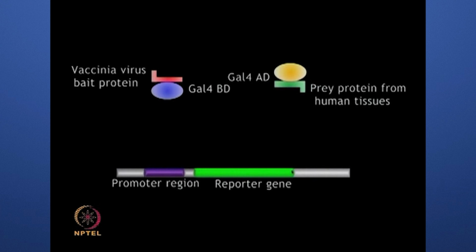So, let me show you by this interaction how this yeast two-hybrid screening can be used. So, let us drag and drop the component so that the transcription will be carried out.